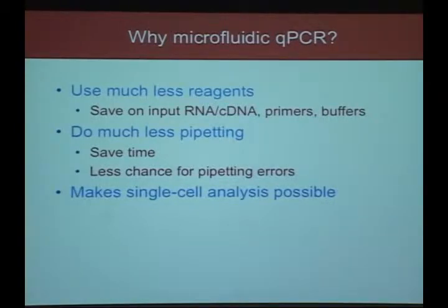And very importantly, you do a lot less pipetting. As I'll show you in a moment, you don't have to make every single combination of primer set reactions and samples. The instrument actually does that for you. So you save a lot of pipetting time, and there's much less chance for error in making all of those combinations by hand. It's the kind of thing you would never ask a technician to do because it would either drive them crazy, or they would make an error, or both. So that's going to be relatively important when you get to larger scale projects.